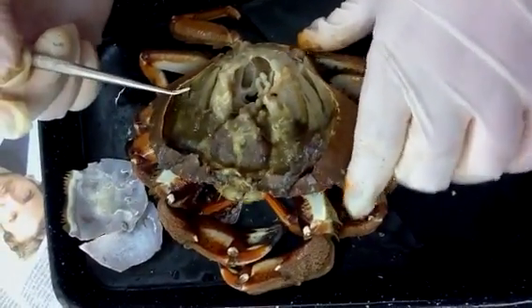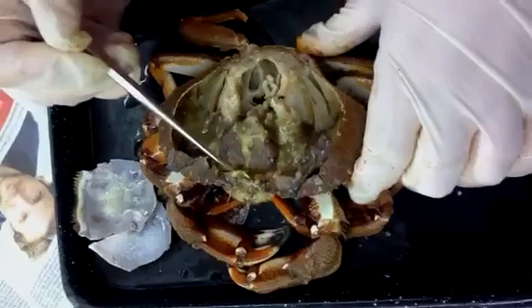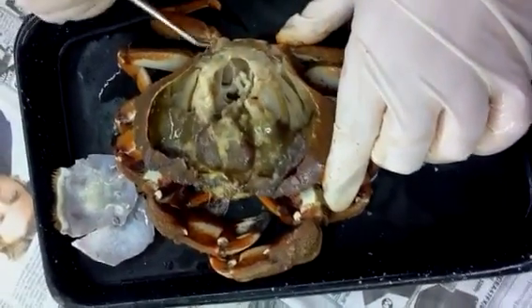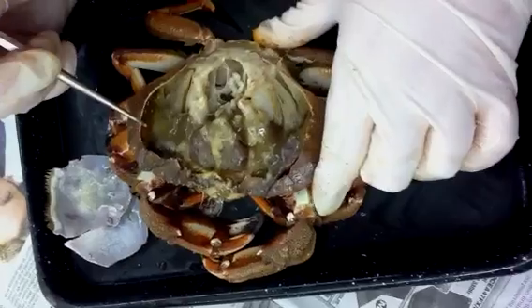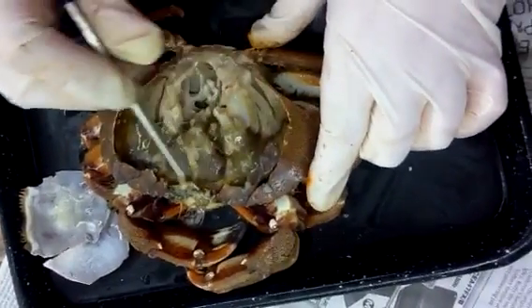This is the dissection of the stone crab. We've already cut into the carapace here, and you can see we came in from the back. This is how the animal would secrete its exoskeleton when it molts, and it would back out of its shell. So we cut in from the same area.